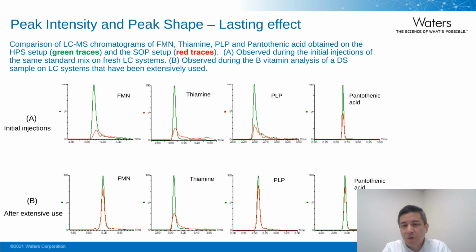And also for the thiamine compound, you can see that after the extensive use, still there's a large difference between the HPS setup and the SOP setup. And also peak shape is not improved over the use of the system.